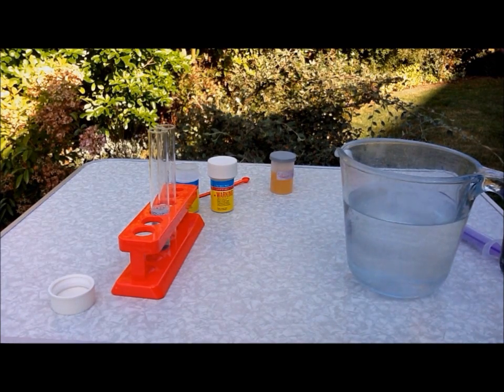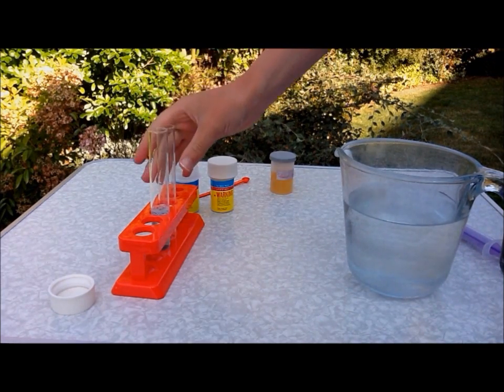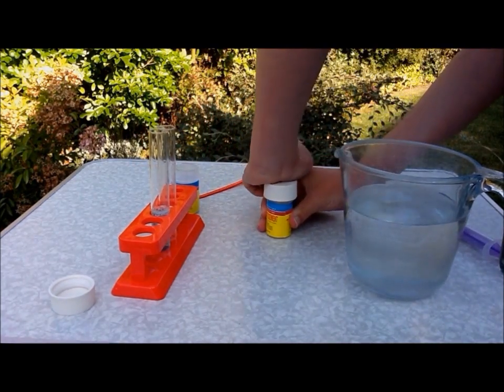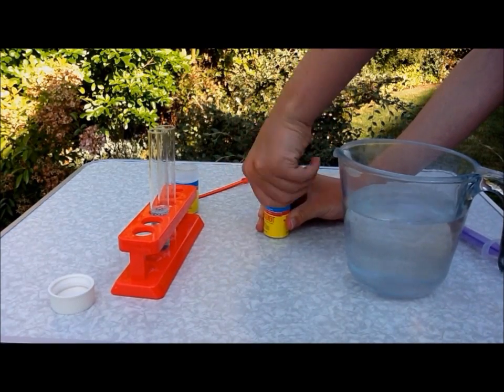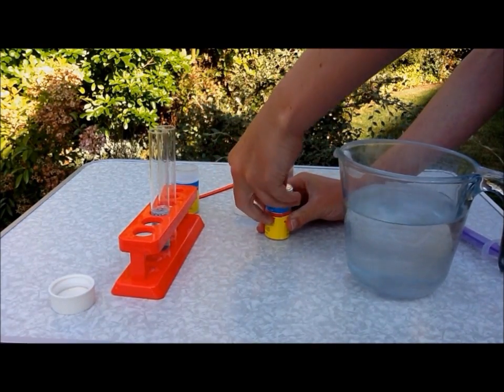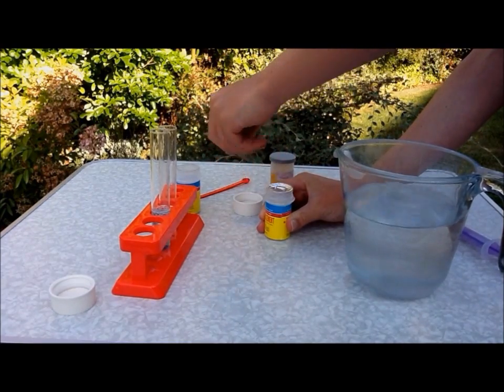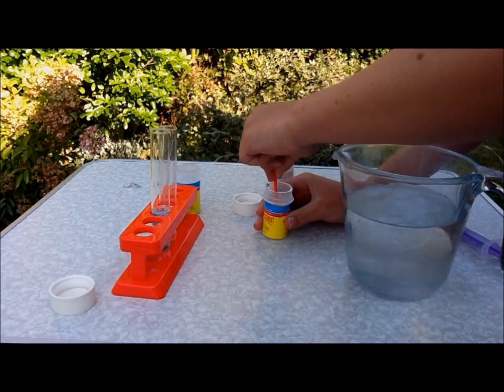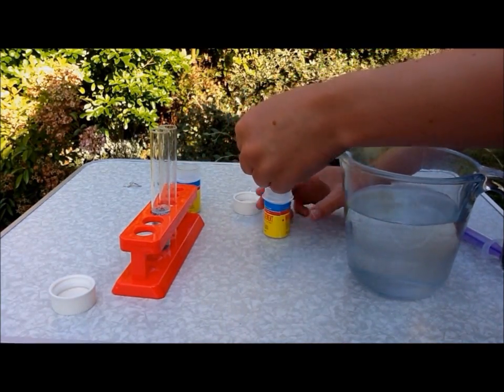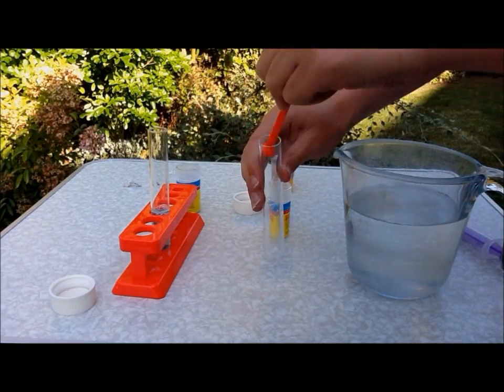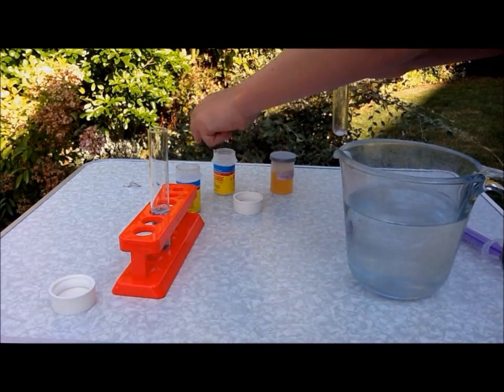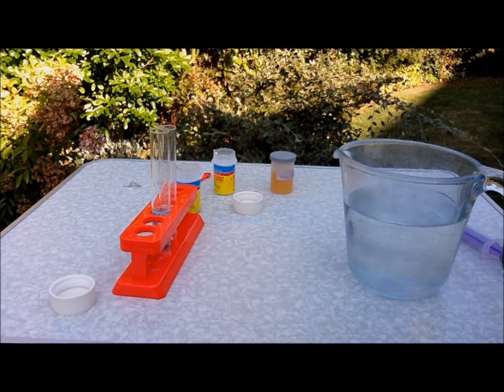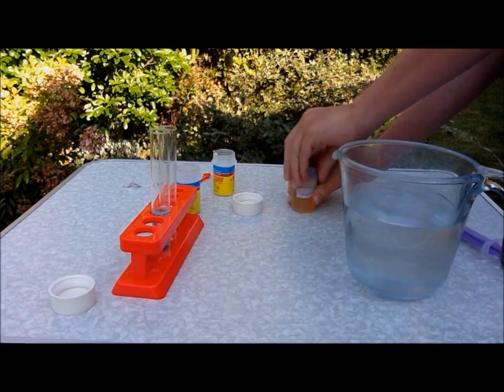Your second test tube will need half as much tartaric acid, so about 0.1g of it, to dissolve in your sodium hydroxide solution. You need to get about 0.1g, put it in the test tube, then dissolve it in 8ml of your sodium hydroxide solution.